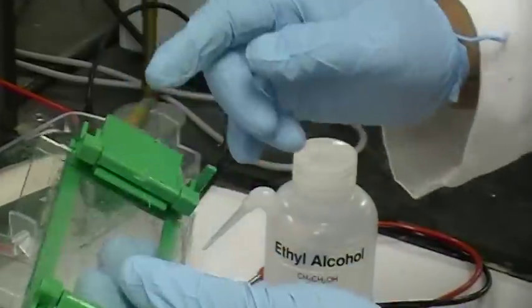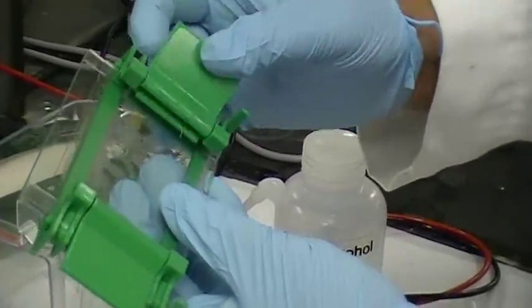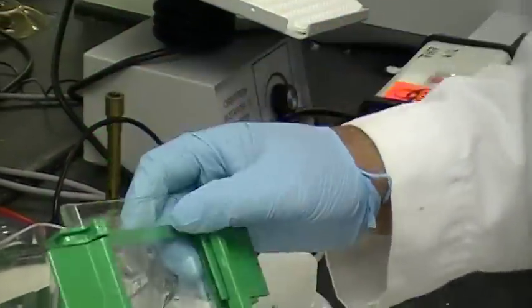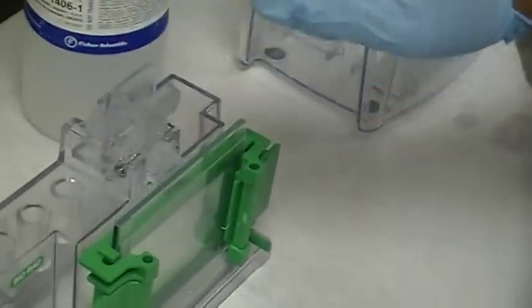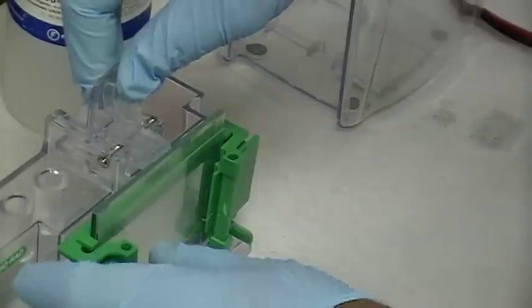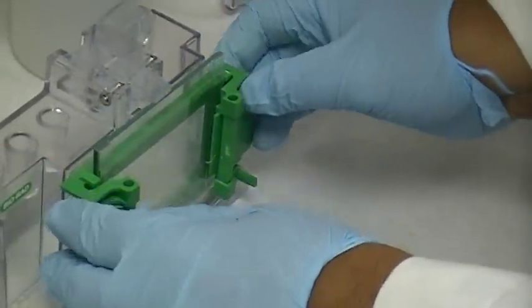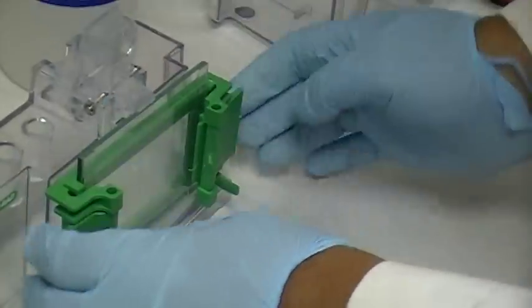The clamp works like this: if you do that, you're loosening the gel plates; if you do that, you're tightening it. Then you put it in like this, with the tall plate oriented toward the clamp. You pull the clamp back and clamp it down. Work it so that it's straight.